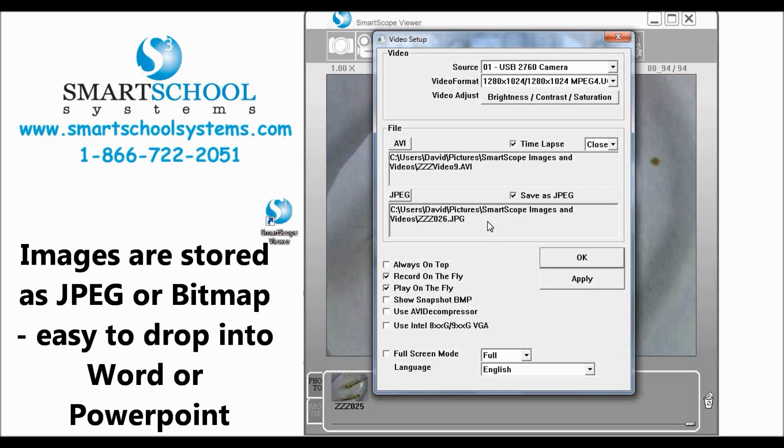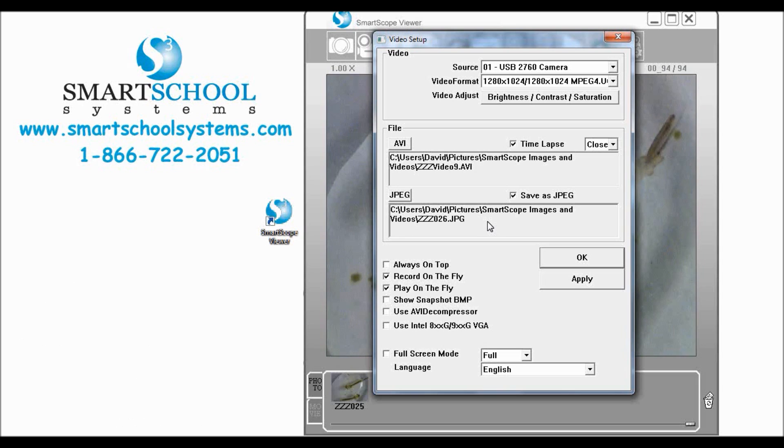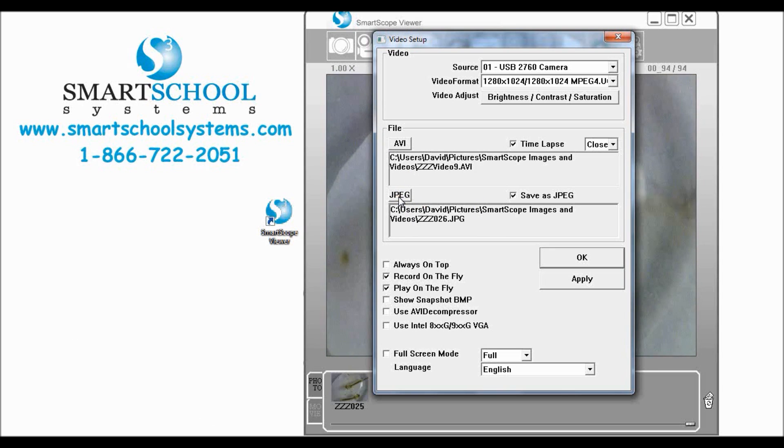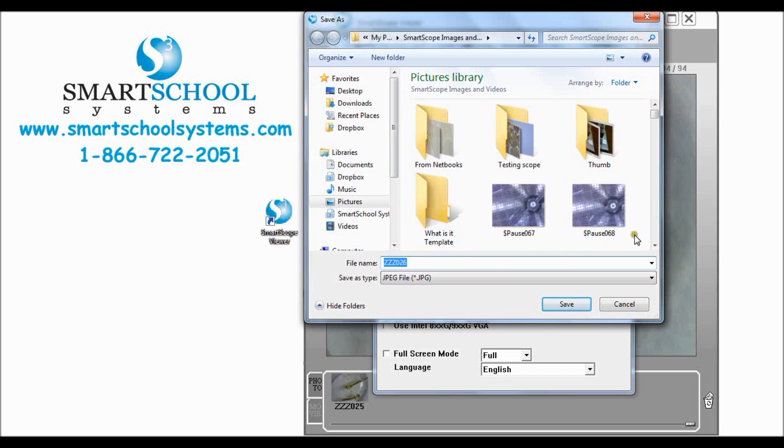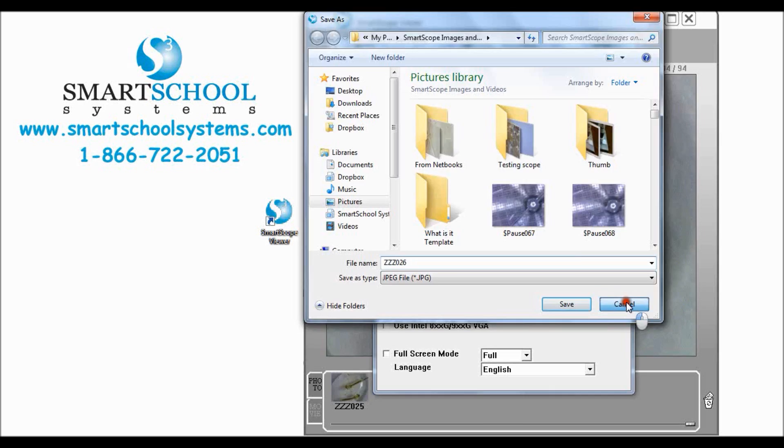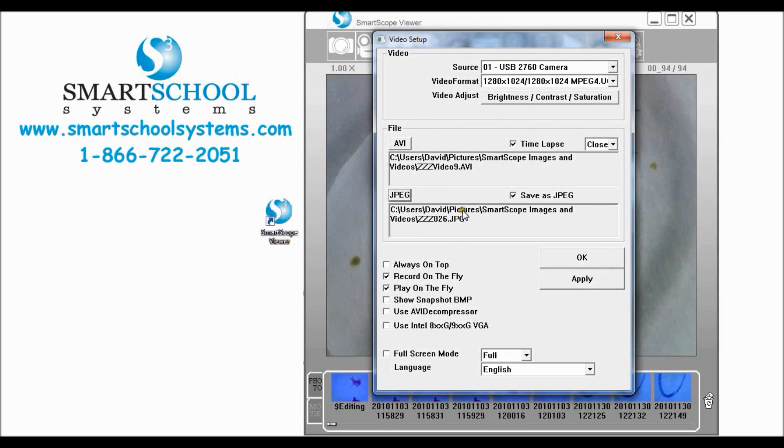You can also change where those images are stored by clicking this JPEG button and you can take this and direct it and tell it exactly where you want to store your future images and then click save and it will store all of your future images at that location.